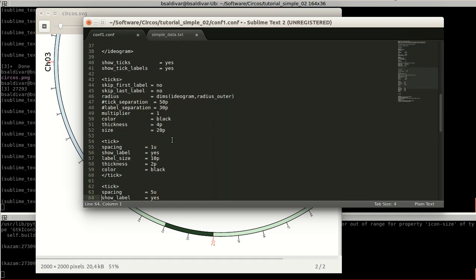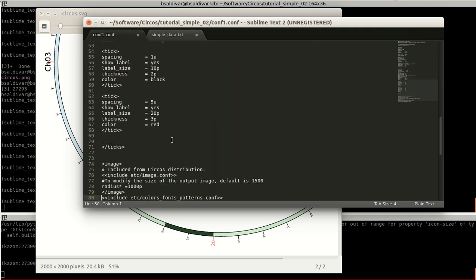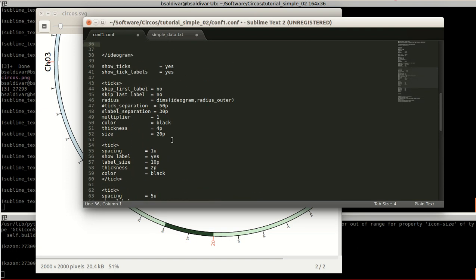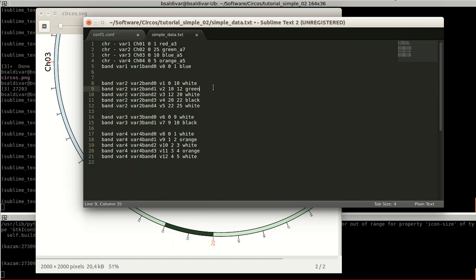So that's basically the part of bands. And the part of ticks that is here below, I will specify what this is. And just when we're going to change a bit here to modify our graphic.